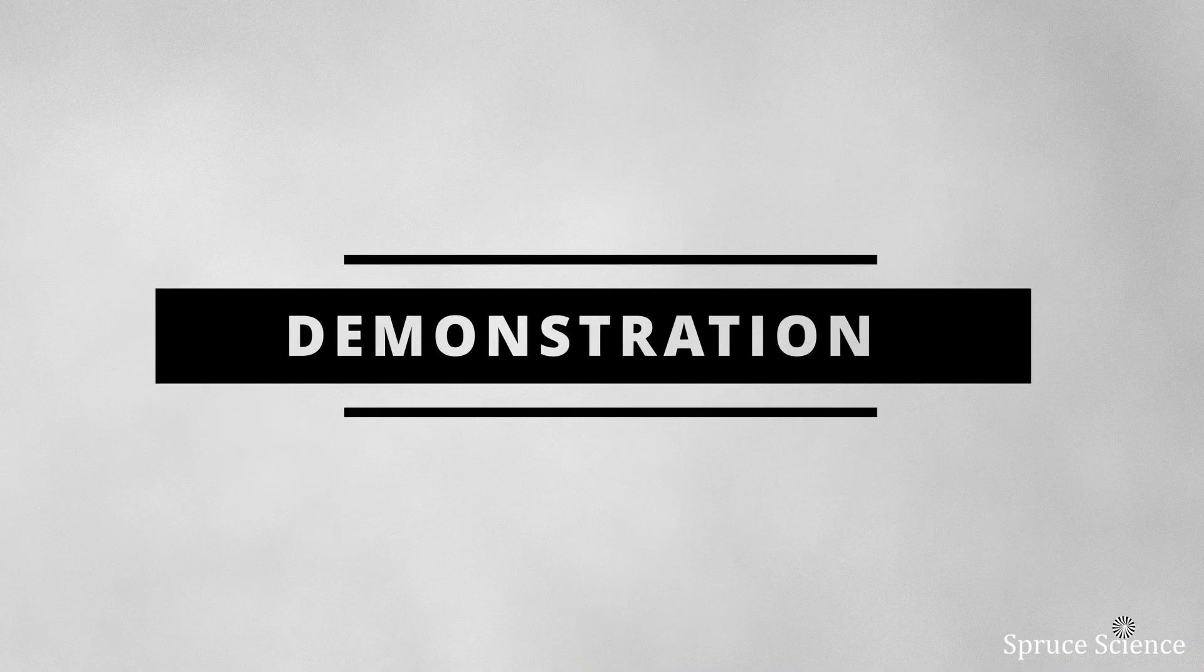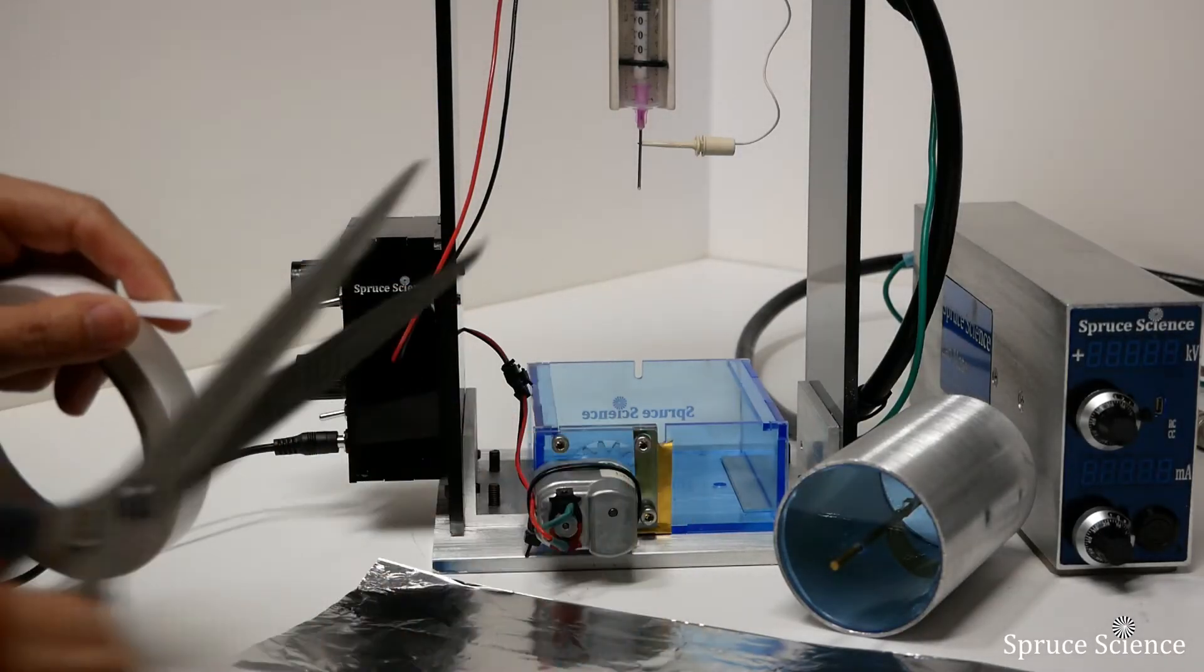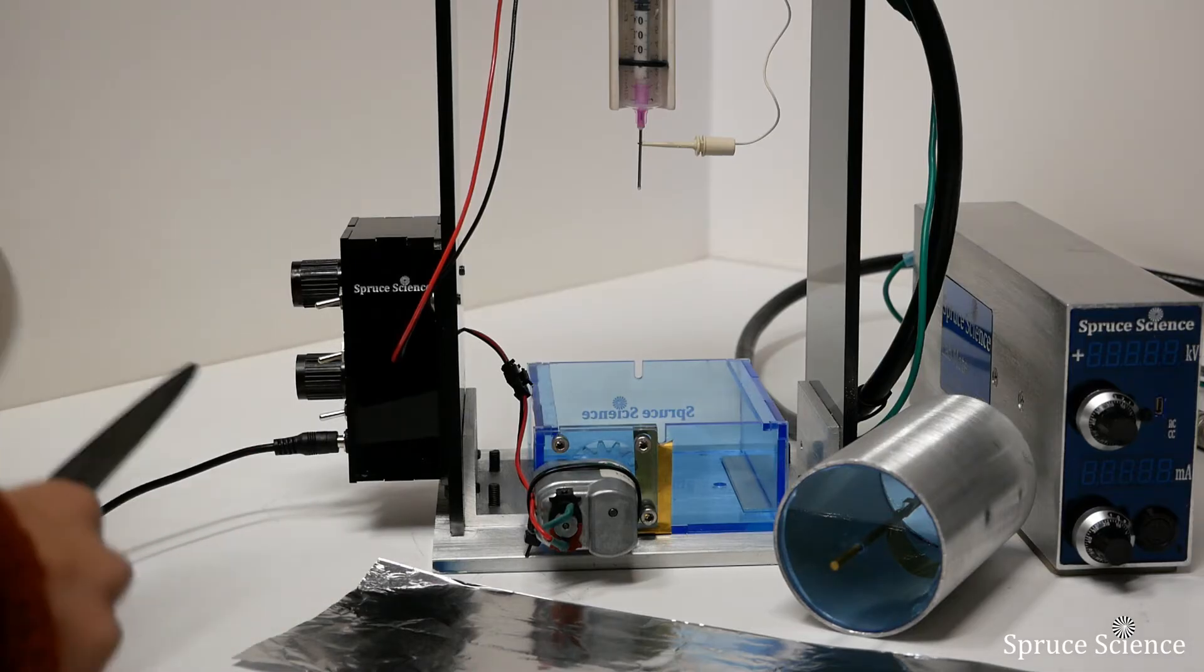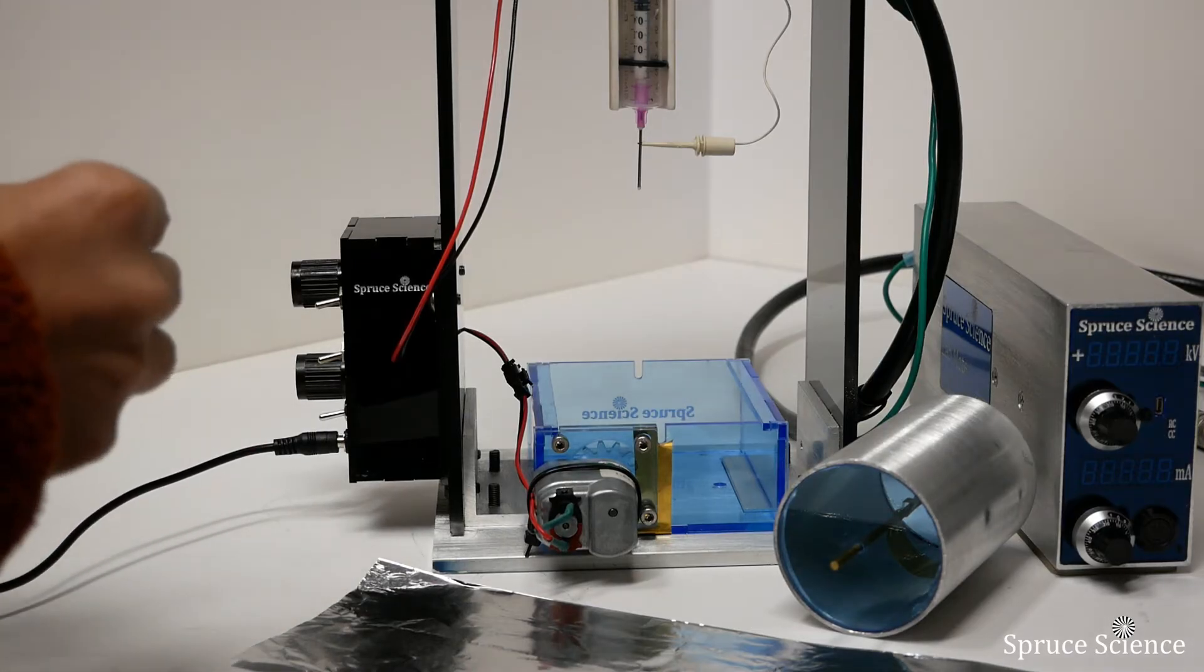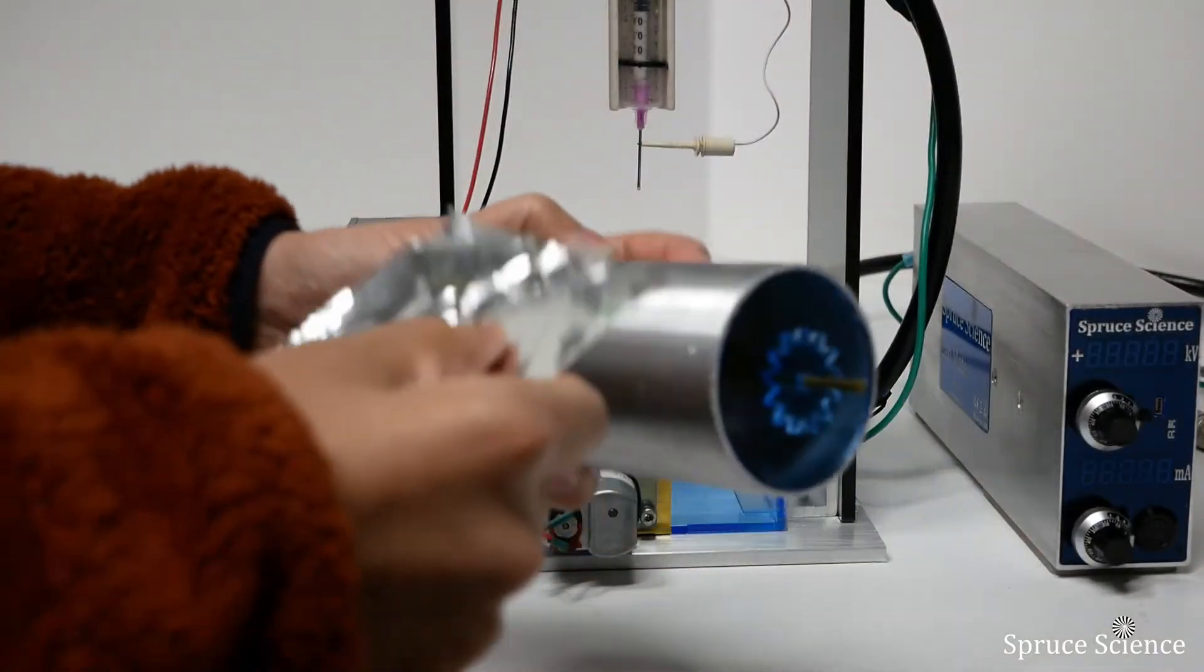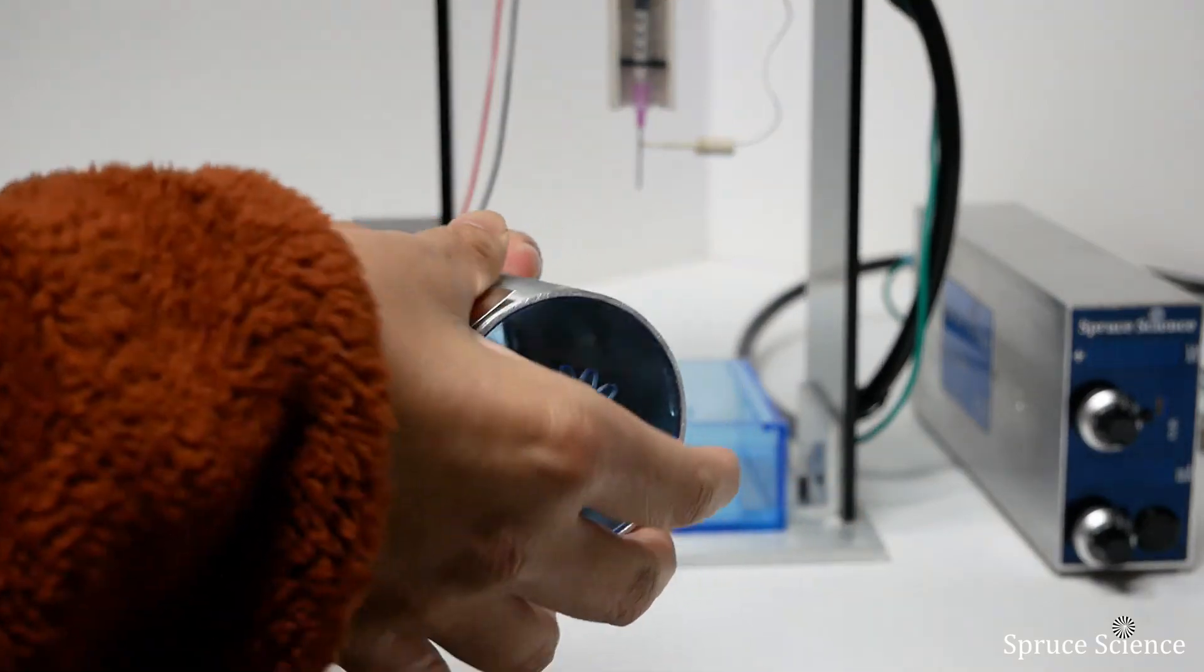The electrospinning machine is ready for demonstration. Depositing the electrospun fibers on an aluminum foil works well because it is easier to gather samples with different parameters that you can go back to analyze later. You can see here that we're using double-sided tape to hold the aluminum foil in place.